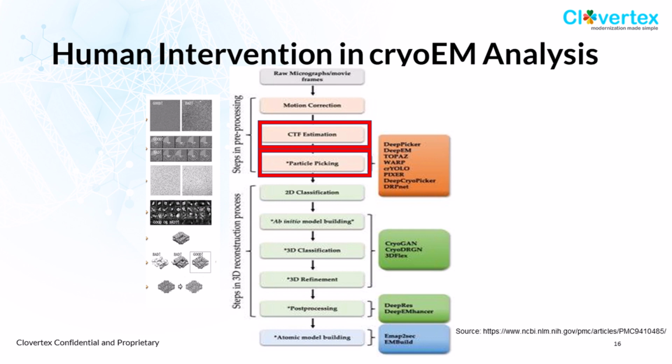For example, particle picking. There are many algorithms developed by many research groups, and nowadays Topaz and Cryolo are the most used ones.